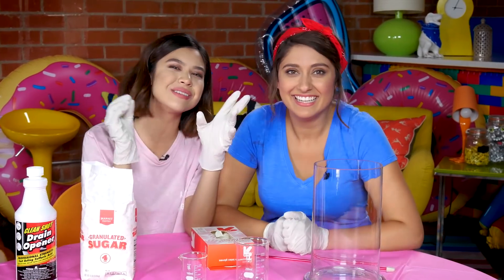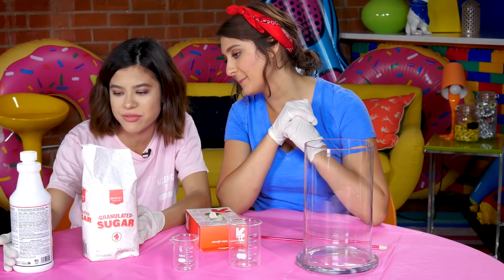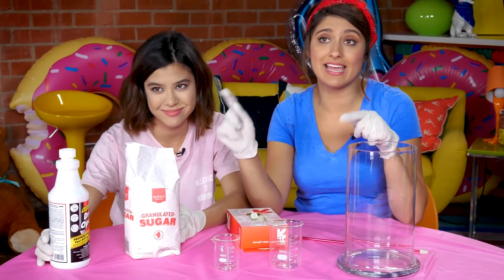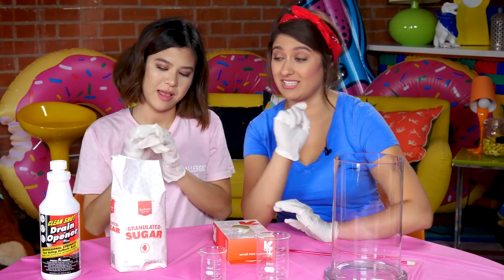Today we're going to do something called The Black Snake Experiment. You're going to need some sugar — we have some granulated sugar — and then we have Good Old Fashioned Drain Cleaner. This is poisonous and you should be very careful with it, which is why we're wearing these gloves. Not just for fashion — I know it looks great — but it's for safety.